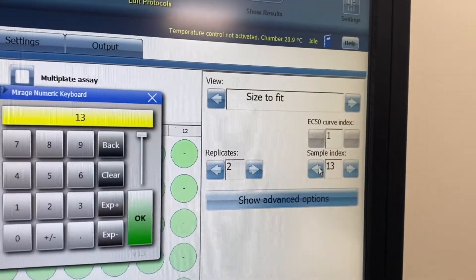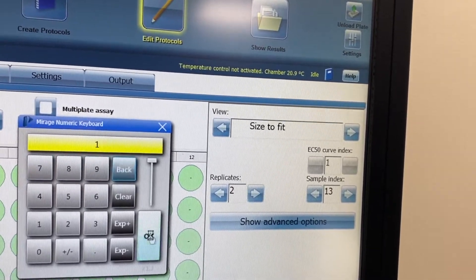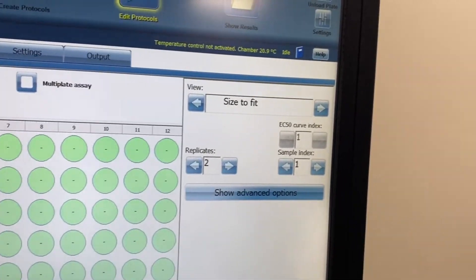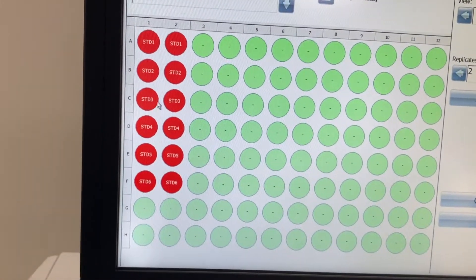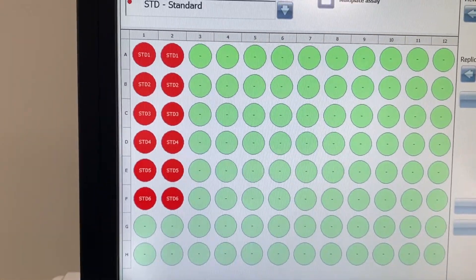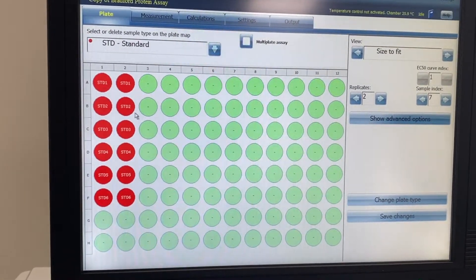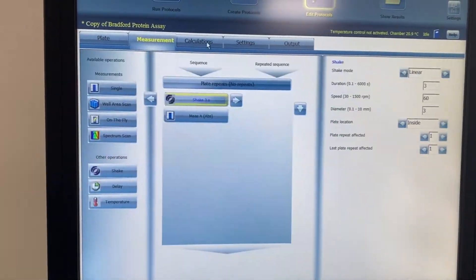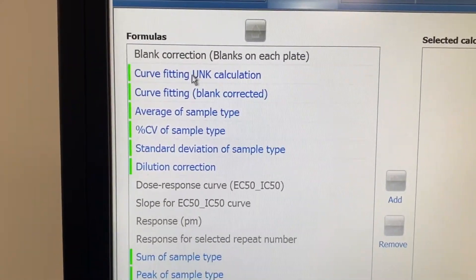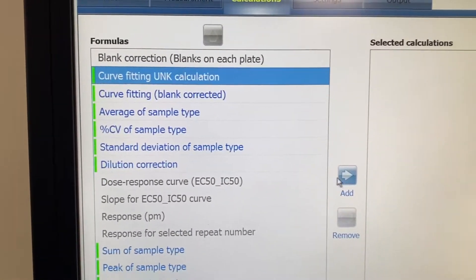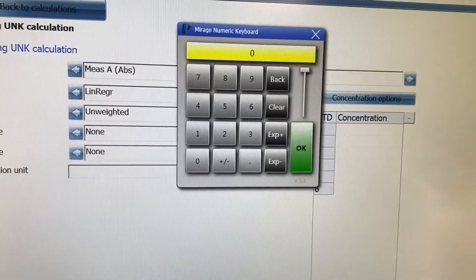Because we deleted the previous entry, it's started back from one. When you click on a well it brings up a pop-up, so you just change the starting number to one. Then if you select the wells here — Standard 1, Standard 2, Standard 3, Standard 4, Standard 5 — you can go ahead and enter the concentrations for those standards. Go to the calculations area and bring across that you've got standards, and hit edit to put in the concentrations.